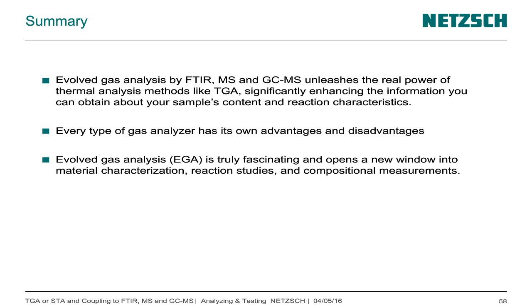Sometimes it's also no problem if you have a cold spot, because I also use some mass spectrometers even at room temperature in the connection. If I only want to detect carbon monoxide, carbon dioxide, and things like this, it's not necessary to heat the adapter. With a skimmer, I would say not so easy, more no. For sure, you can do things, and I also did some things during my time at university, but not so easy. So with a transfer line system, yes. Okay, thank you.